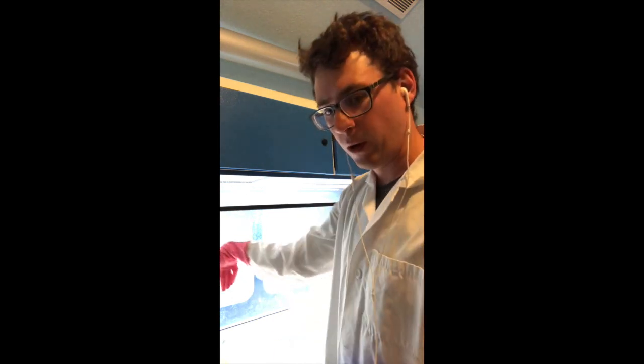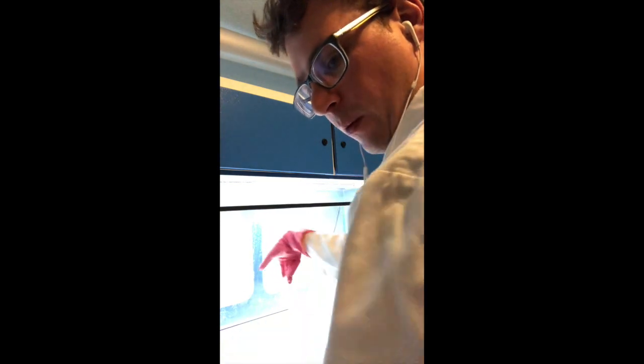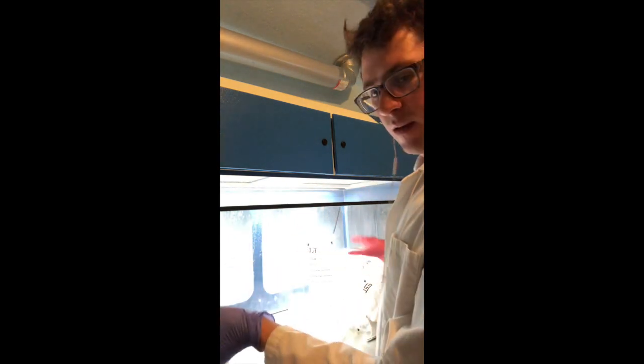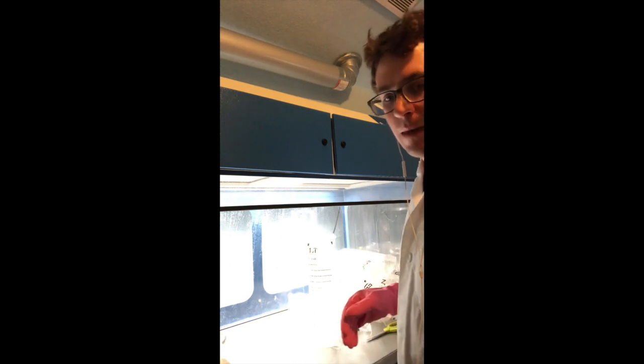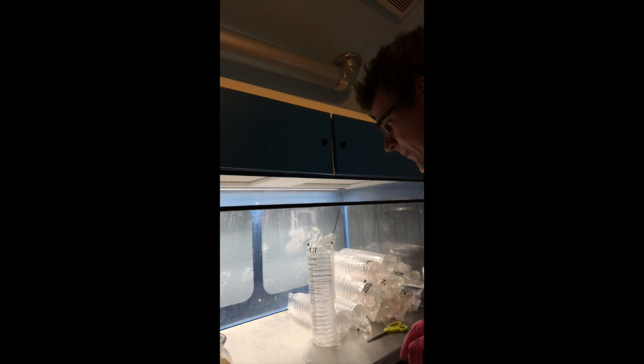And then while I'm pouring, I just want to make sure that I'm taking the jar and pouring it away from me. And that way I won't contaminate any of the plates. But I'm just gonna go ahead and play this footage and you'll get a really good understanding of my procedure. I'll try to focus it in on the hood over there.